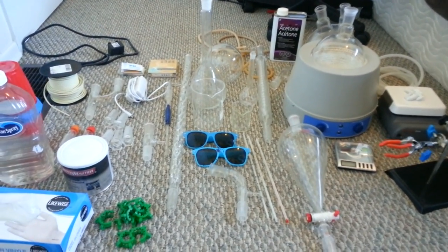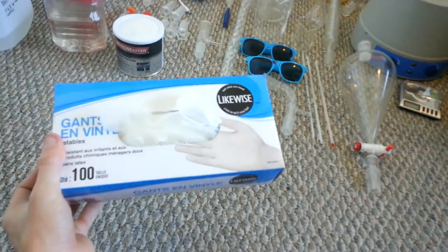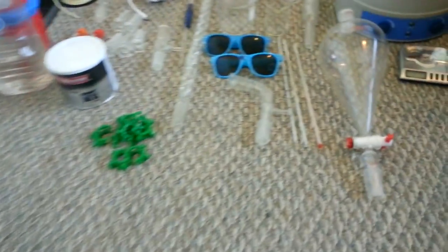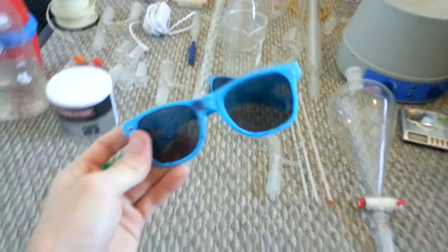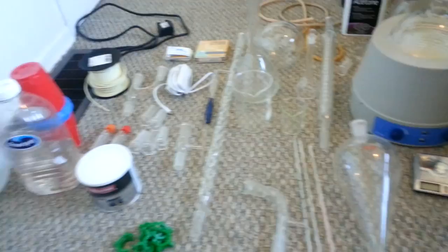Let's start with the safety things. Most important, get some gloves. If you're dealing with acids or anything like that, they are very, very good to have. They're like five bucks for a hundred — don't be cheap. Safety glasses: probably a good idea to have actual ones, but I find these work just as well. And for me, that's all for safety.